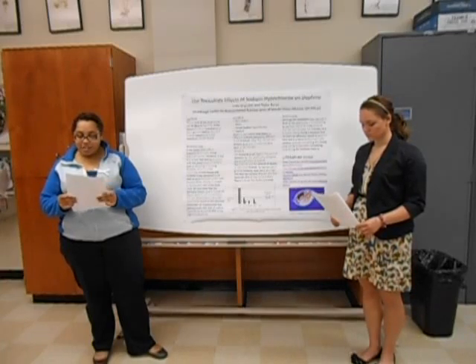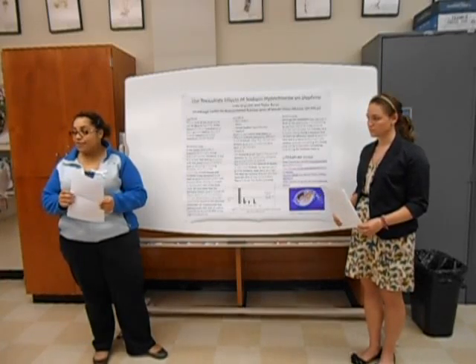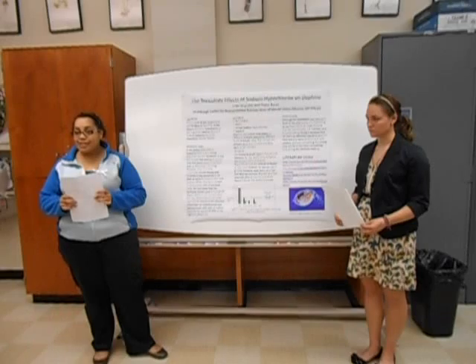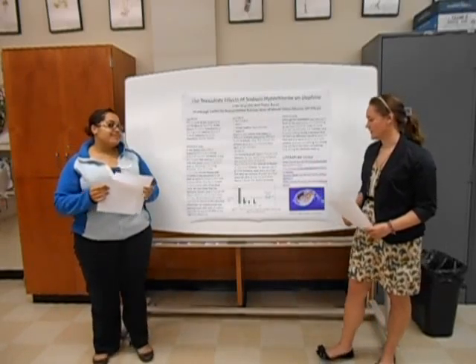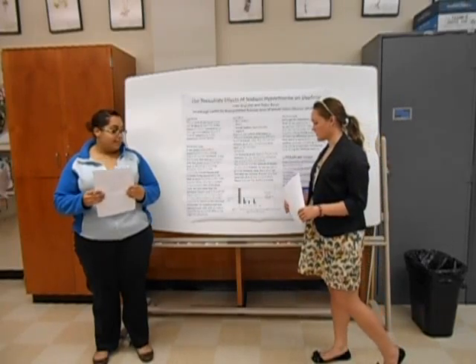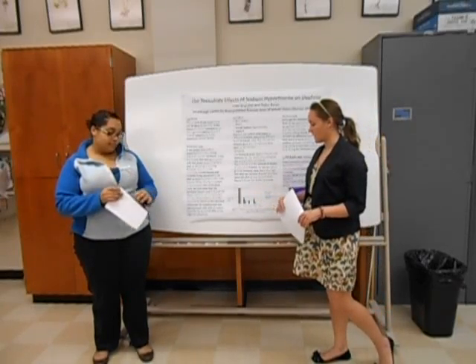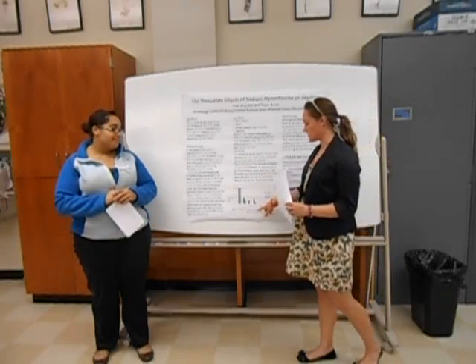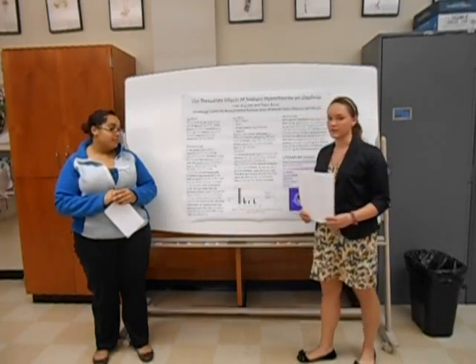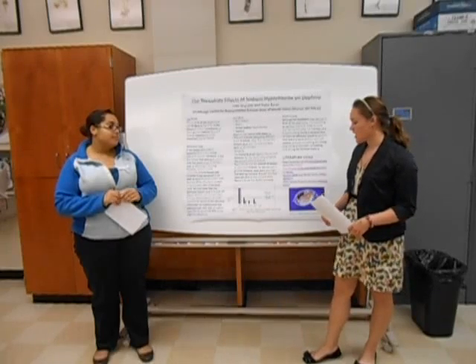And we then measured the total alive after 5 minutes, and then again after 10 minutes, and that will be discussed further in the results. Okay, so we have a graph that shows how many Daphnia were alive after 5 minutes and how many after 10, and at the bottom it has the amount of bleach that was added to each mixture.